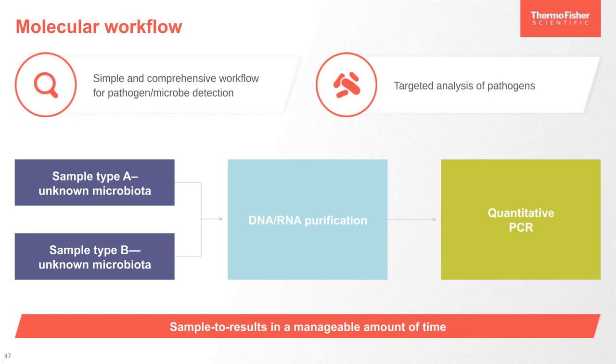Alternatively, we have the molecular workflow, which is a similar workflow, but simplifies it immensely. So, most of these have been converted into high throughput, even automated. And so you have multiple samples, one method, one downstream output. So simple, comprehensive, and allows for targeted analysis. So you're able to get your sample to results in a much more manageable amount of time, sometimes even within a day.